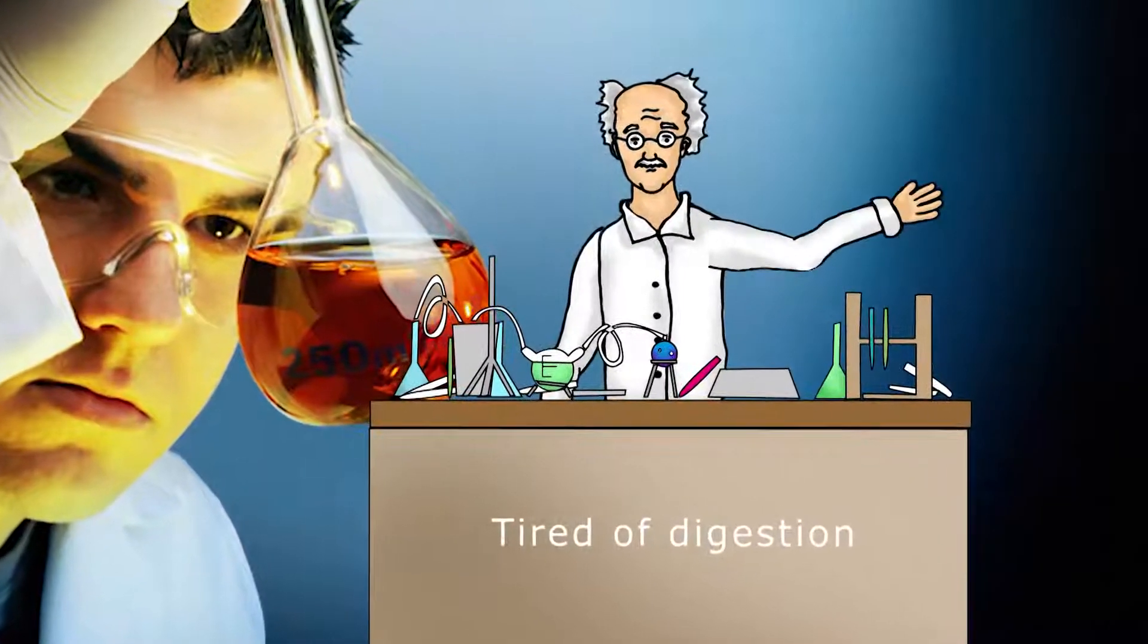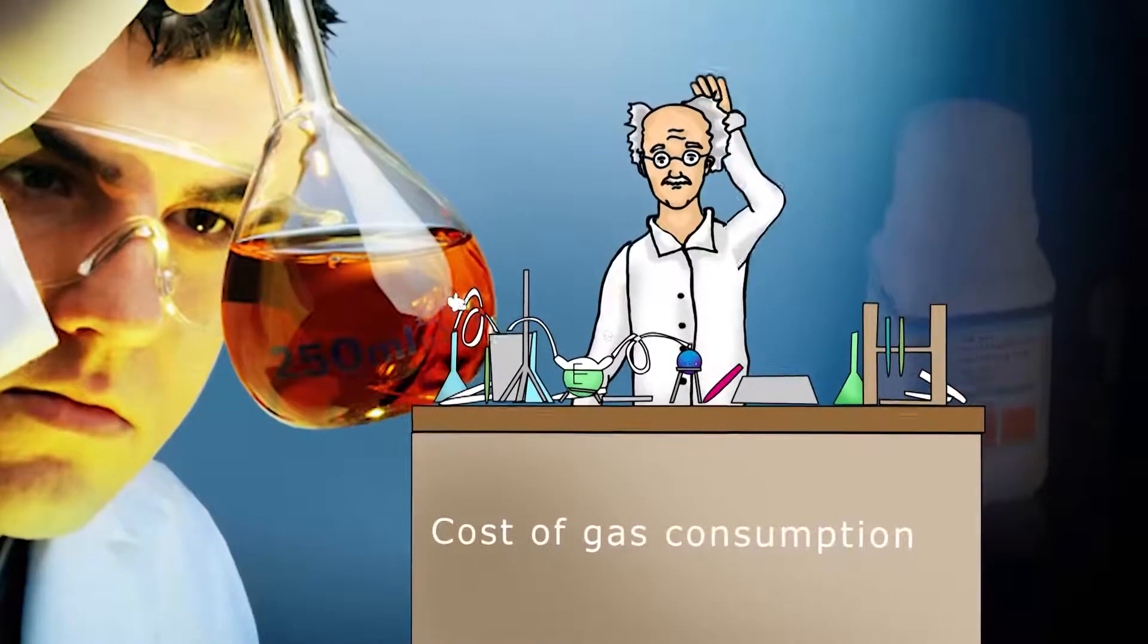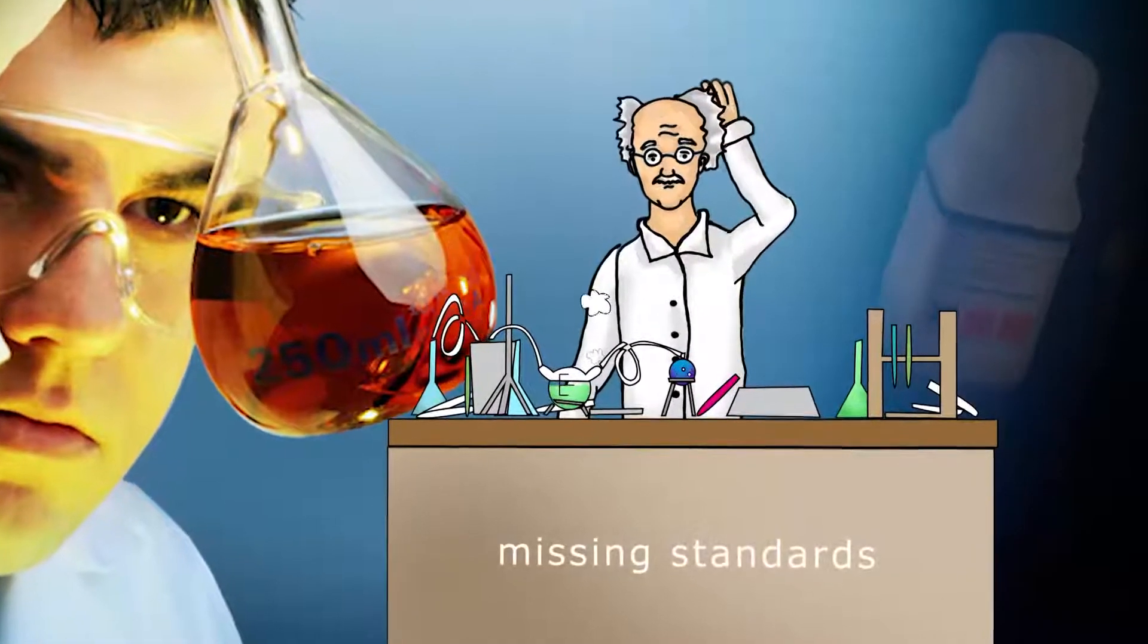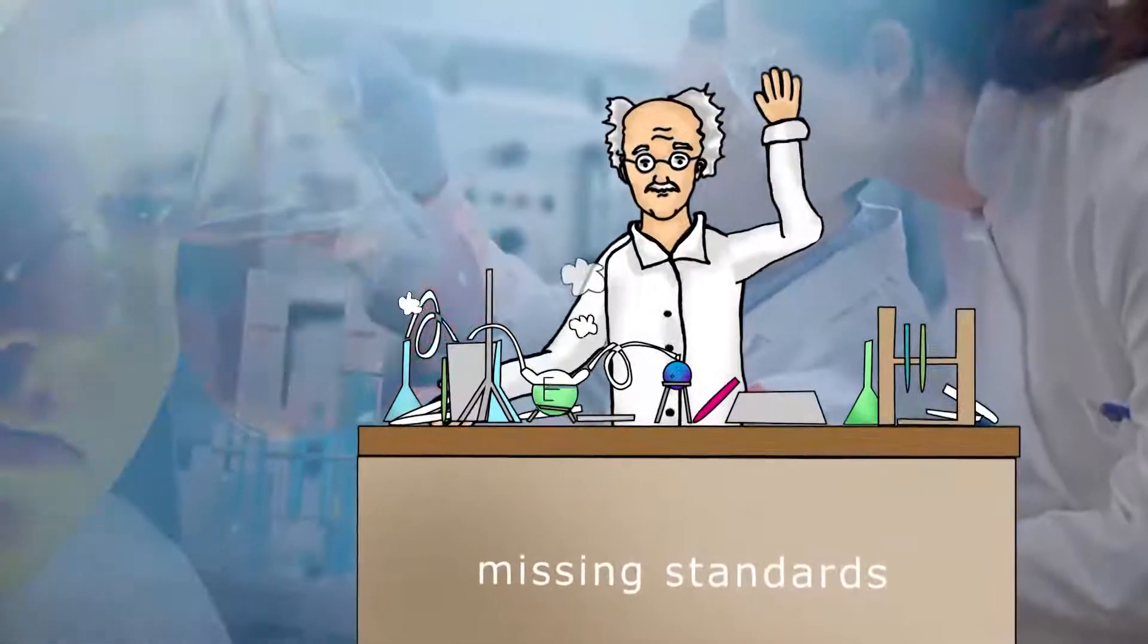Tired of sample digestion? Annoyed about costs for gas consumption? Missing any collaboration standard in case of urgent need? No expert for your advice available?